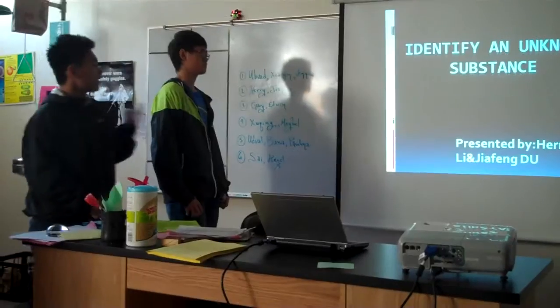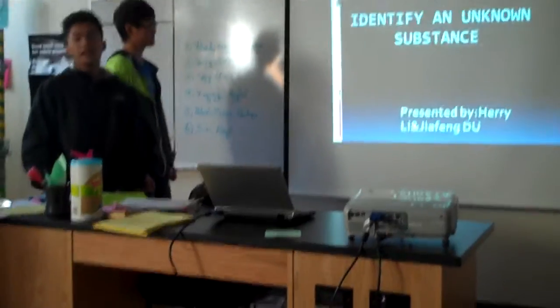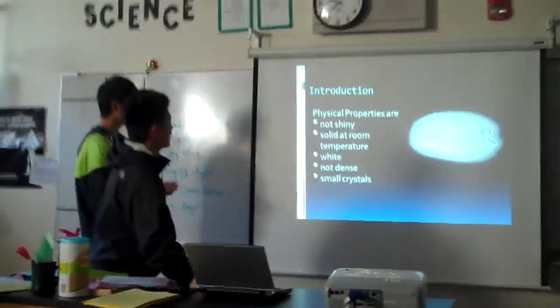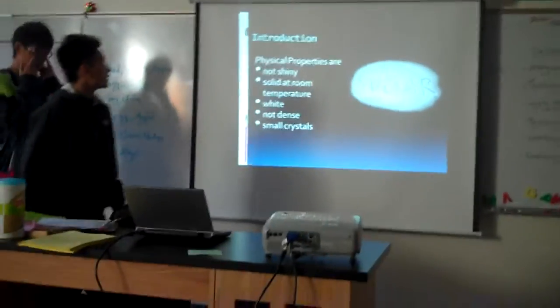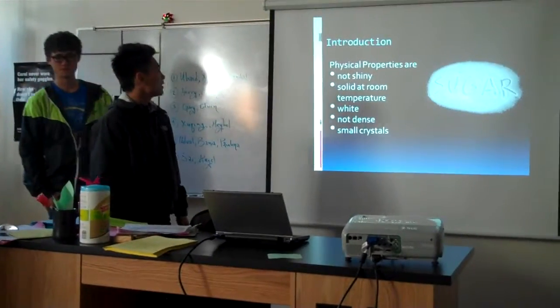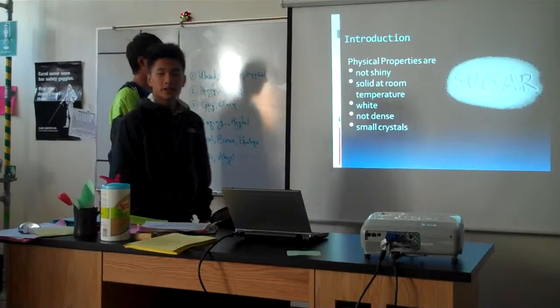Our group is Herry and Jiafeng, and our project was identifying an unknown substance. So basically, the physical properties of our substance are: not shiny, solid at room temperature, white, not dense, and small crystals.